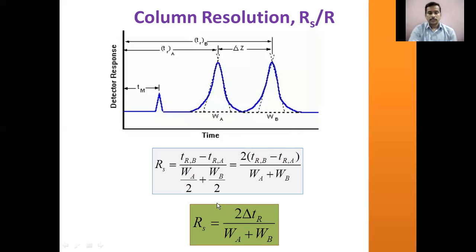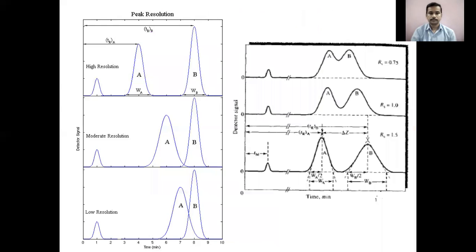So this chromatographic resolution is very important, as I told earlier, in order to decide whether the solutes are getting separated without any overlapping. If there is any overlapping, meaning one solute is getting eluted with the other solute, then the separation is not going to be adequate. Therefore, the chromatographic conditions are set in such a way that there is no overlapping between the peaks.